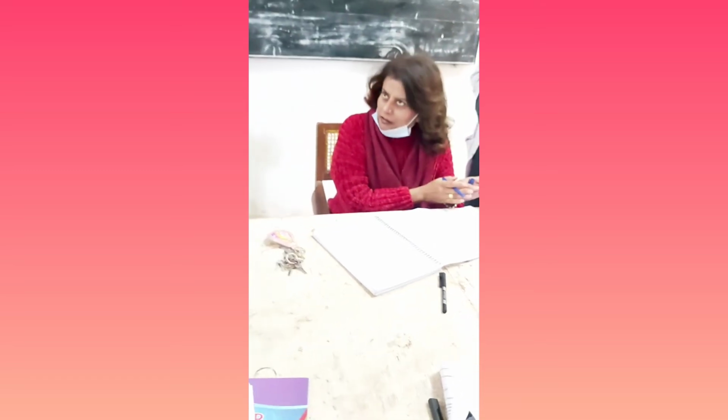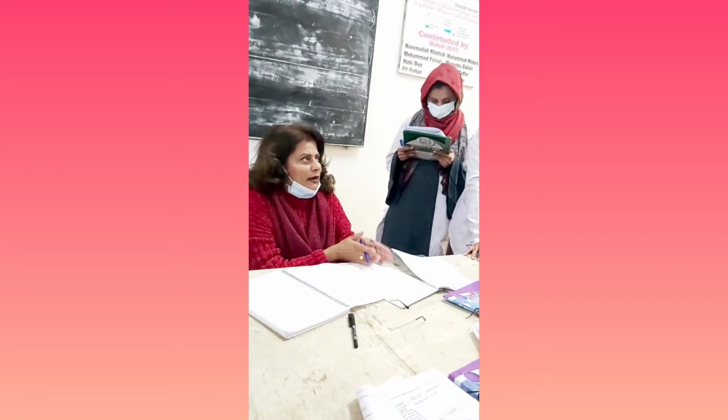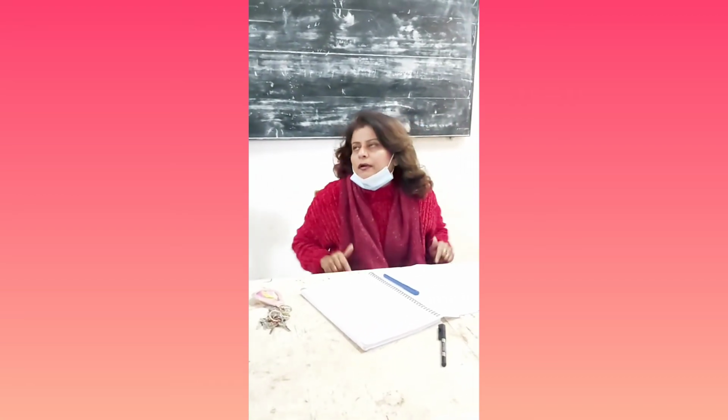So in that sense, you are going to do the three tests by first of all preparing sodium extract, which is called Lassaigne's filtrate. Lassaigne was the scientist who developed this method to convert covalent compounds into their ionic form so that they can be detectable. Then you are going to perform these three tests: the test for nitrogen, sulfur, and halogens. Now, your turn. If you want to ask anything, you can ask, and then start your work.